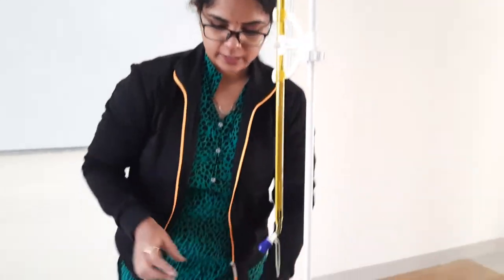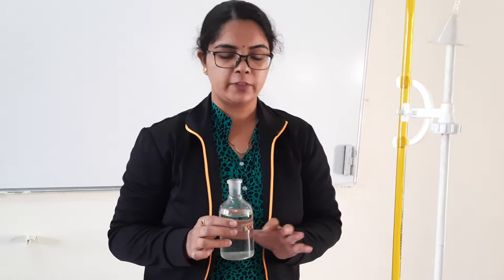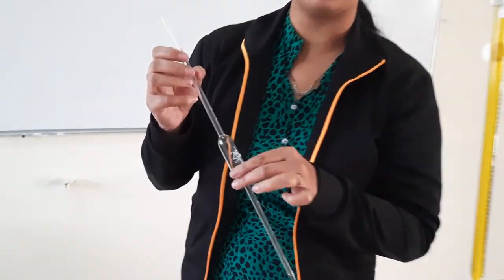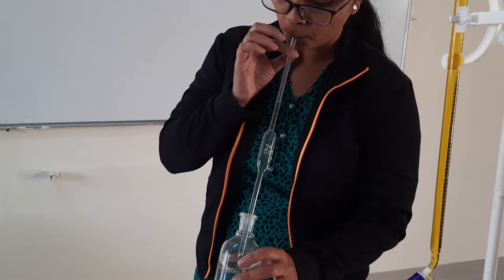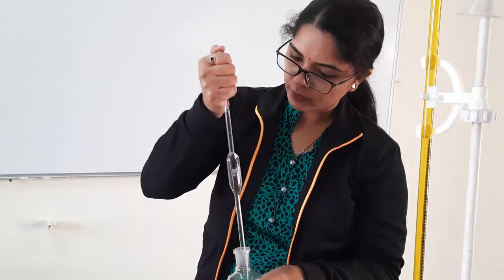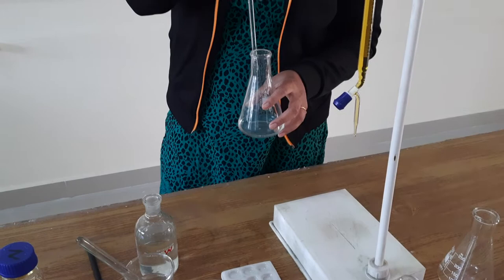The solution is acidified — acid has already been added. Next we take the known solution of ferrous ammonium sulfate; its strength is N/40 and we have to take 25 ml using the pipette. Till the mark, we have taken the solution and we transfer it into the conical flask. Do not blow it — always let it flow through gravity.